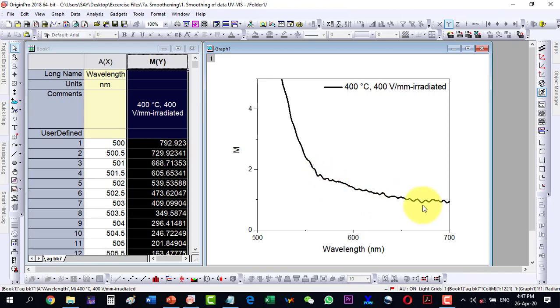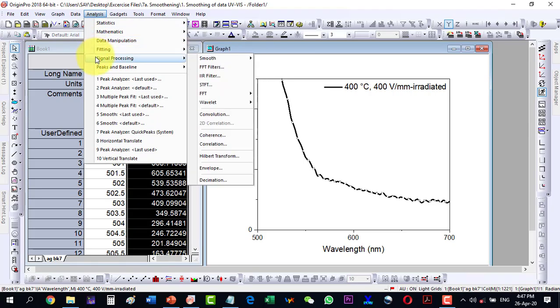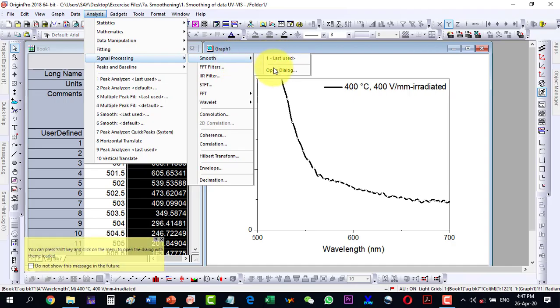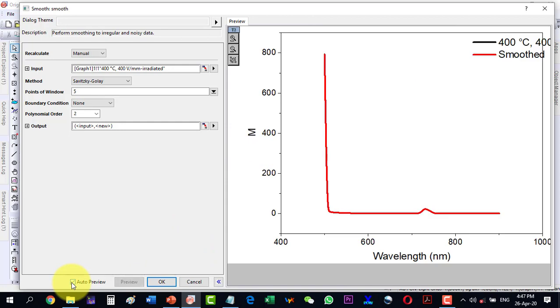Select the plot and then go to Analysis, and in Signal Processing go to Smooth and open the dialogue. As we open the dialogue, a box will appear. The very first thing we will have to do is enable the Auto Preview.